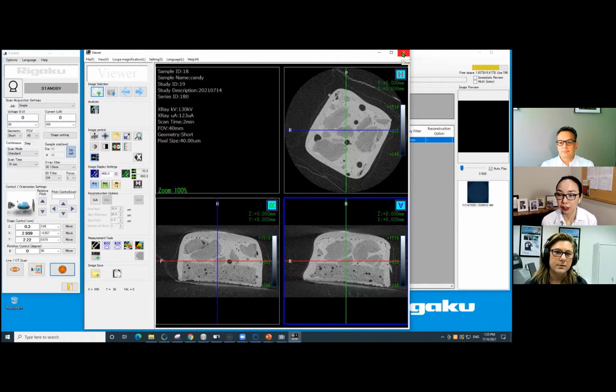All right, which letter was this, by the way? This was S. S was the correct answer. Okay, so that was the right one.